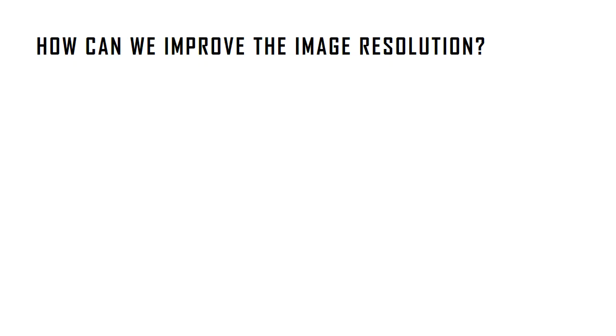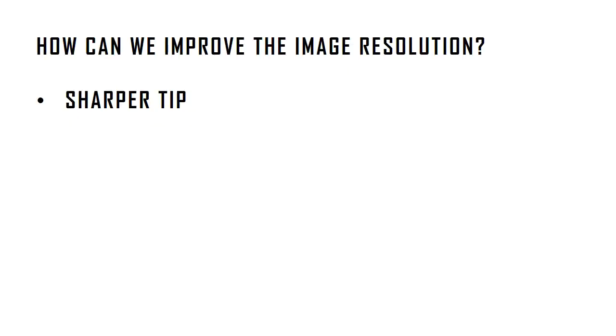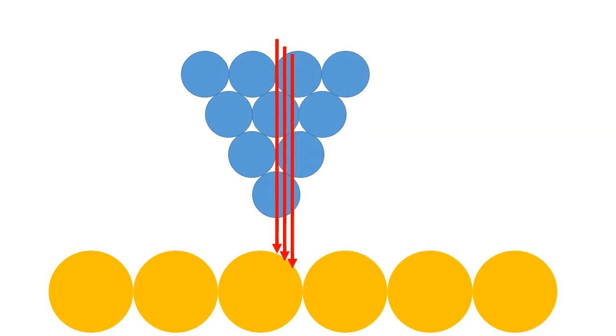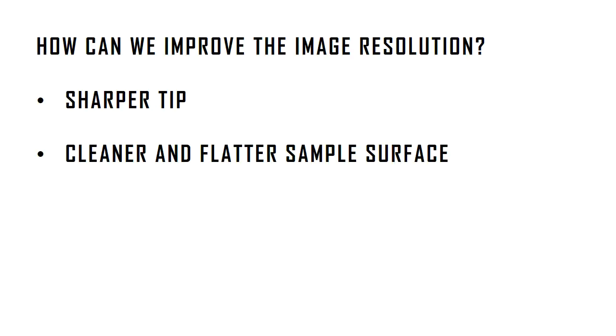With that, how can we improve our resolution of the STM image we obtained in this experiment? Firstly, we can make the scanning tip sharper. A blunt tip will cause interference in the current received, as now tunneling can occur at many atoms instead of 1. Hence a sharper tip would ideally mean to have only 1 atom of the tip, which would improve the resolution.